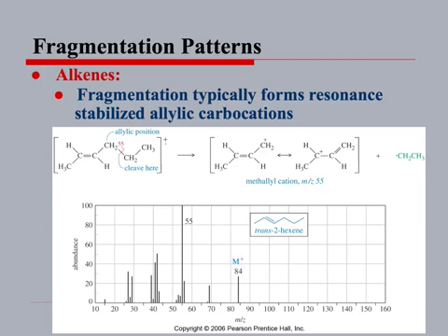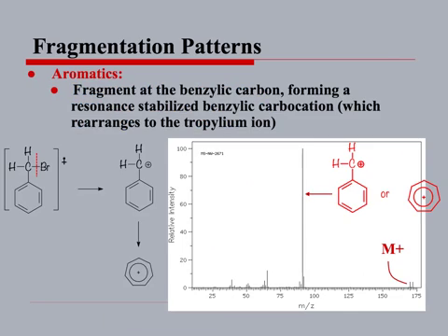Anyway, you can calculate the molecular weight of this, but this is a molecular ion. Again, this is the base peak, which is the highest. This is the parent ion peak, and the rest of the peaks correspond to certain fragments, maybe methyl, maybe ethyl. So if you find a peak corresponding to 26 or 29 or 15, they correspond to certain fragments from this molecule. That's how we determine all this.